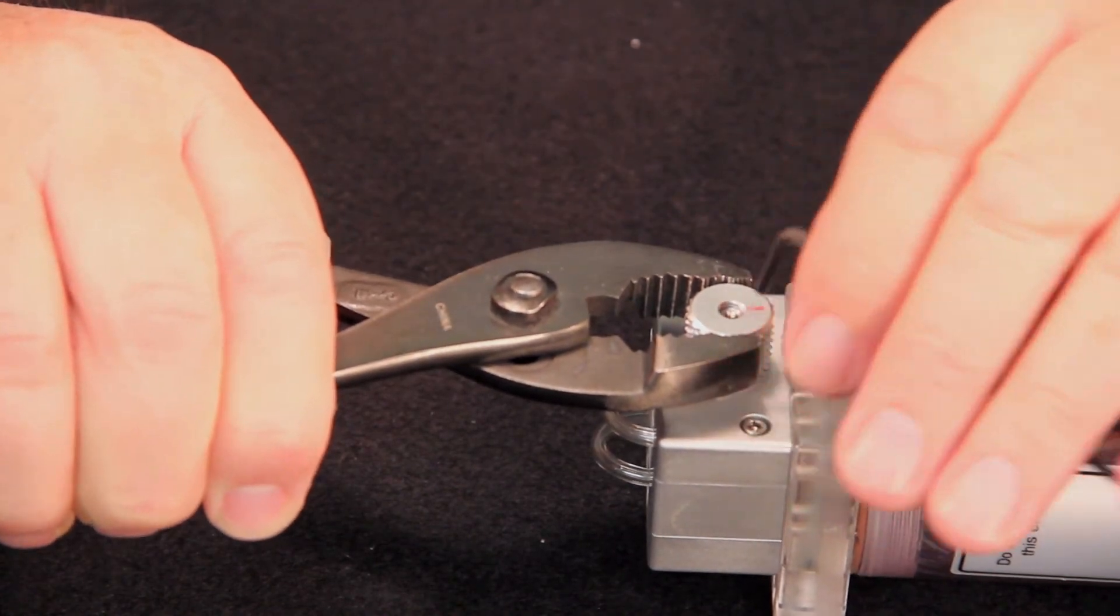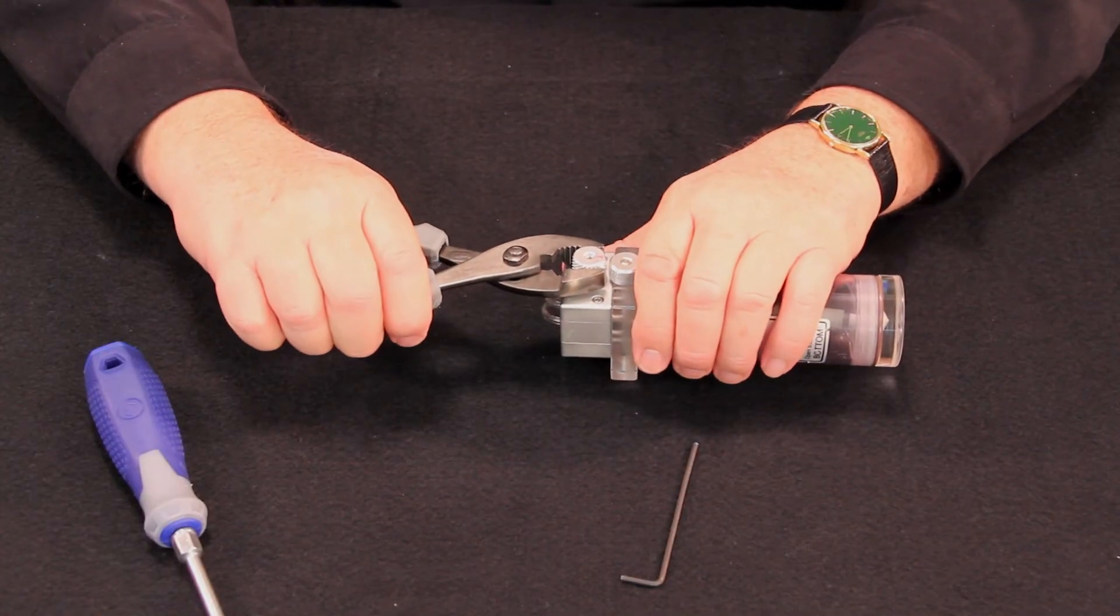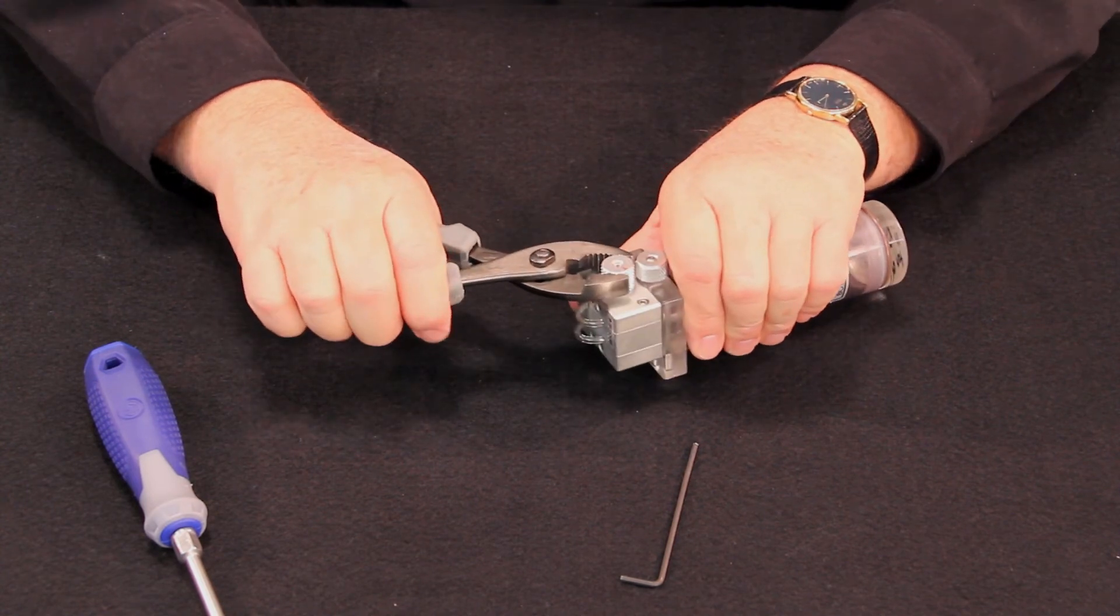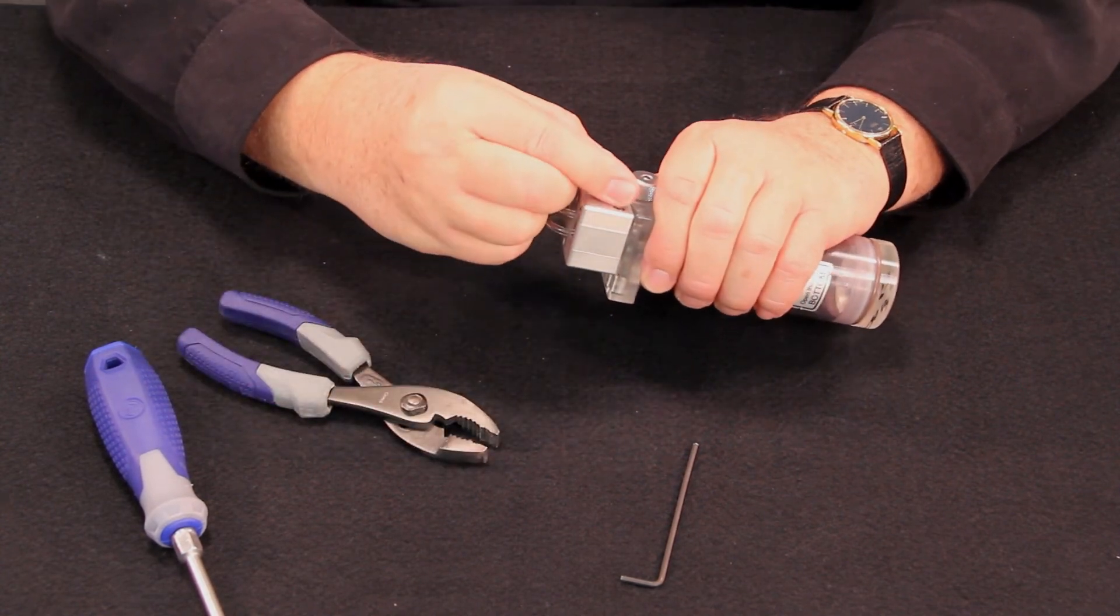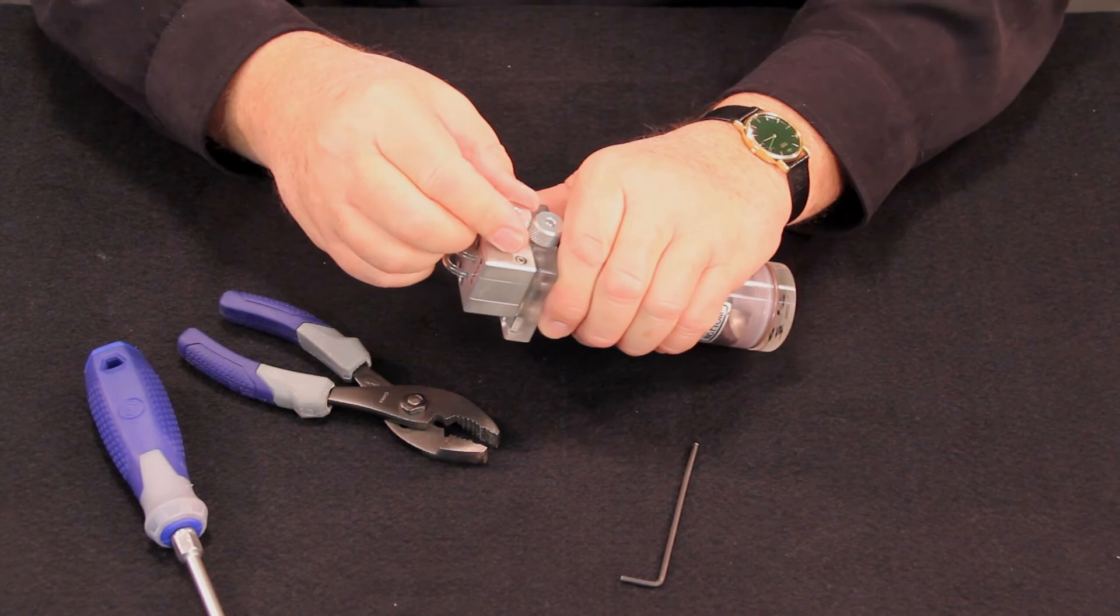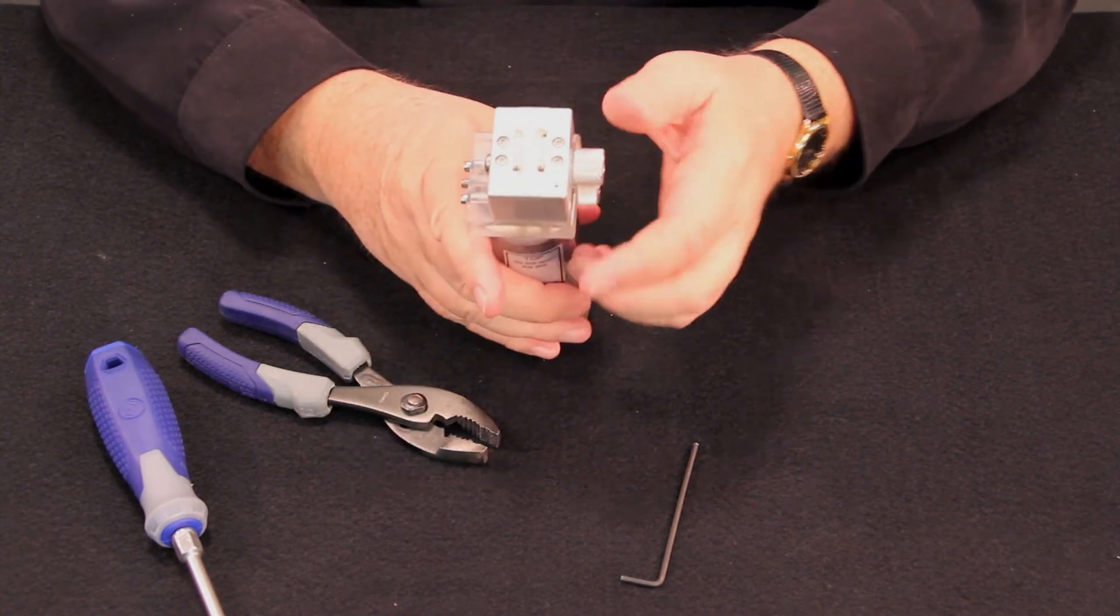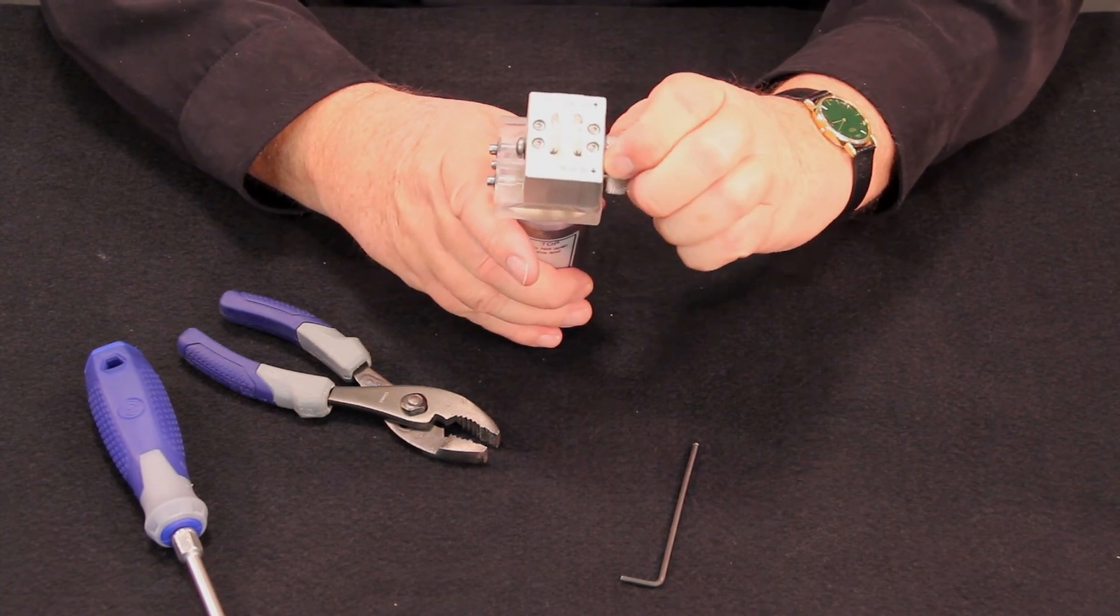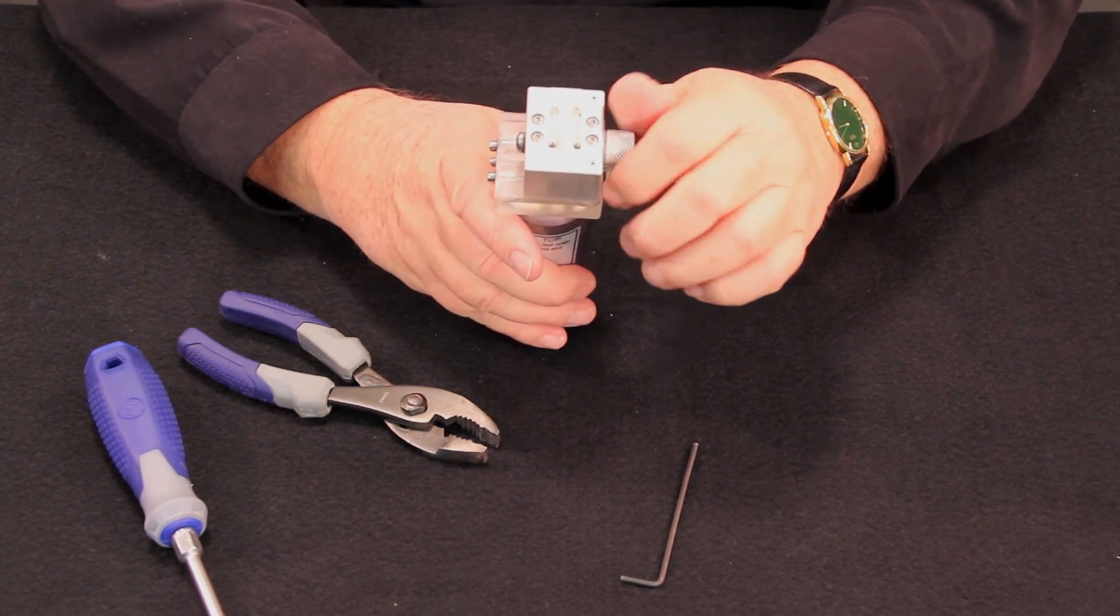Once the set screw is tight, you can back the flow control knob off one quarter turn and now check to see that the knob operates from full bypass to full scrub without coming loose from the Phillips head screw.